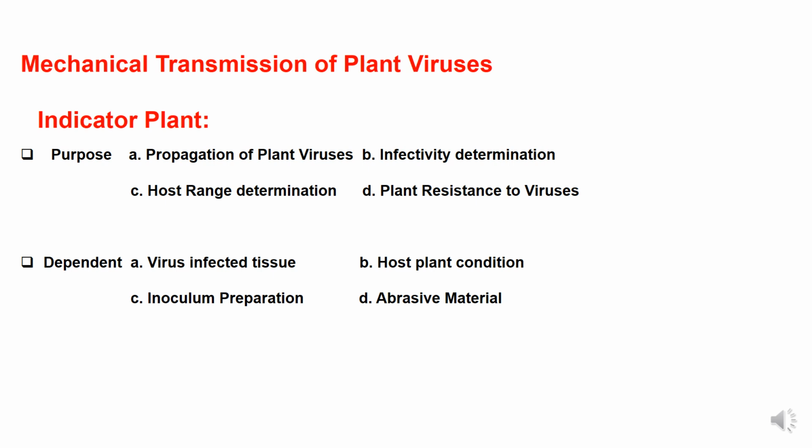This method is used for multiple purposes. For example, to check the propagation or infectivity of plant viruses, and also the host range of plant viruses. This method can also be applied to test the resistance of any plant against viruses.